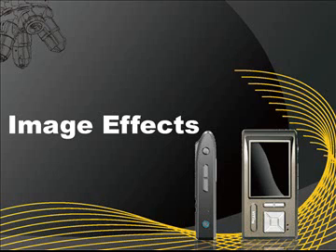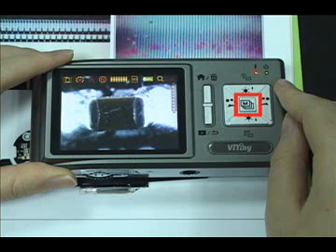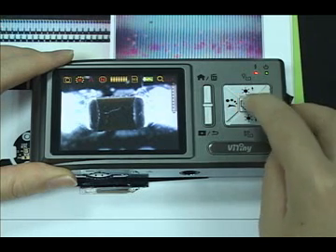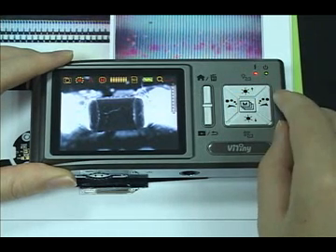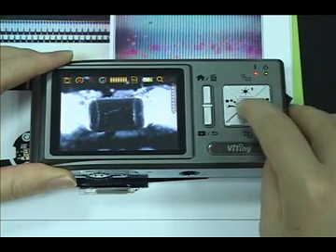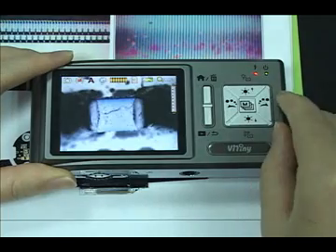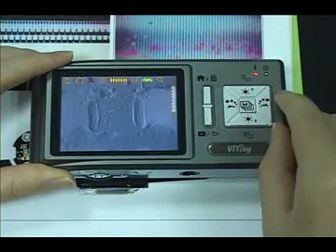Image effects: press the middle button to switch image effects, which are normal, grey, inverse, and inverse grey.